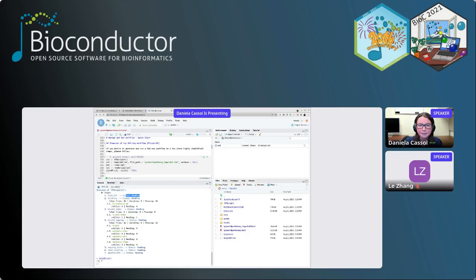Another quick thing we can see is, for example, for the trimming, we are expecting 16 files. We don't have any file on disk. We don't have access to any of those expected files. And of course, we are missing 16. And then the other thing I'd like to highlight is that mapping has 4 sub-steps. You can see HISAT2, then the same tools to sort the BAM and to make the index of the BAM as well.